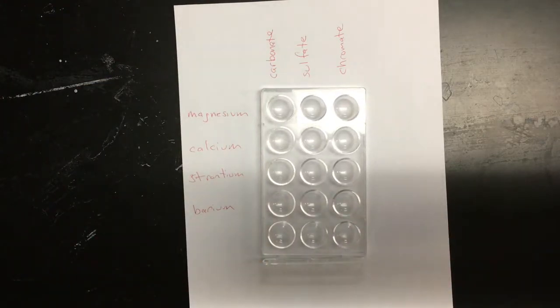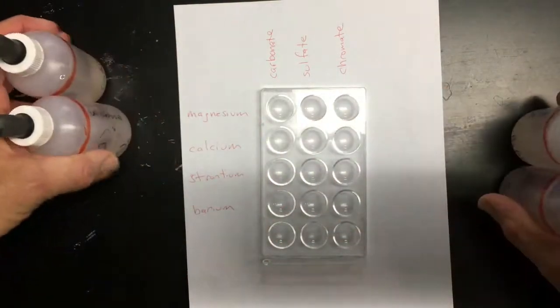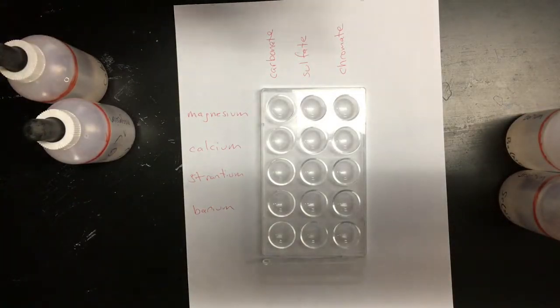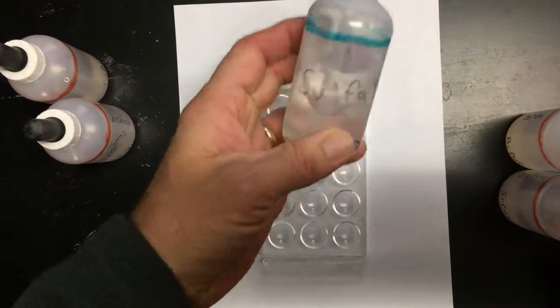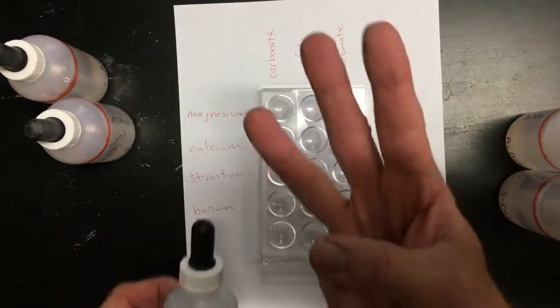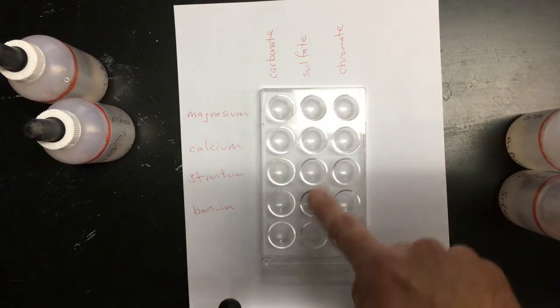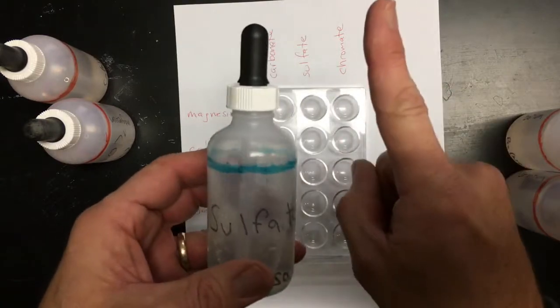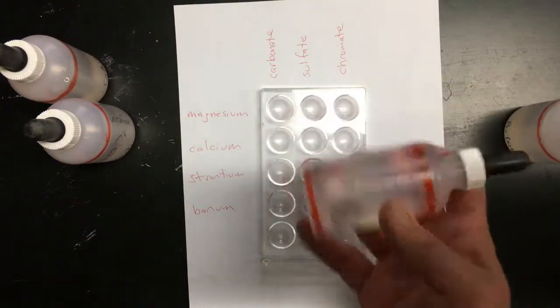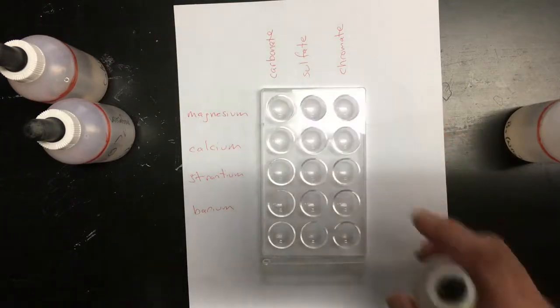And then take the chemicals as they get passed around the room. Here's the orange ones. They're going to go along this side. The blue ones will go along the top here. So in my hands, I'm holding the sulfate. The sulfate goes here. So I'm going to put 3 drops into each cell. I don't need to go down to 4. 3 drops here, and I'll pass this to the next group. When I get something else, let's say I get the strontium, that goes across here, I'll put 3 drops here, 3 drops here, 3 drops here, and pass that on to the next group as well.